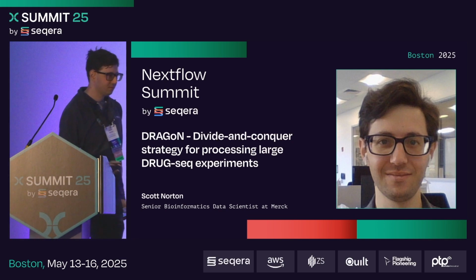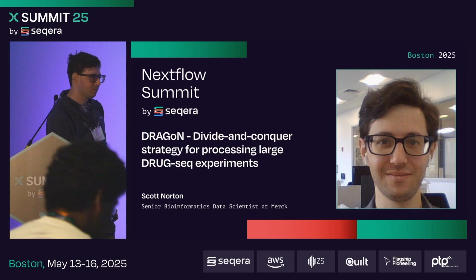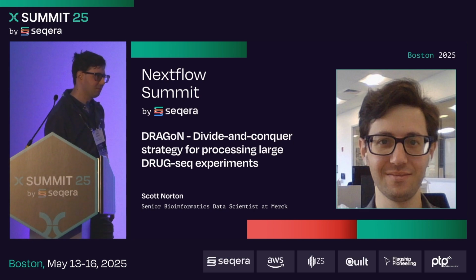Thank you for the good presentation. I also used to try to align DRUG-seq data in different ways. But I find that when doing the downstream analysis, there are still some empty jobs there. It's because they are single cell level based, so the matrix is not like the regular bulk RNA-seq. It's more like single cell, which is more sparse. So can your DRAGoN pipeline solve this question, or do we still need to solve it at the single cell level?